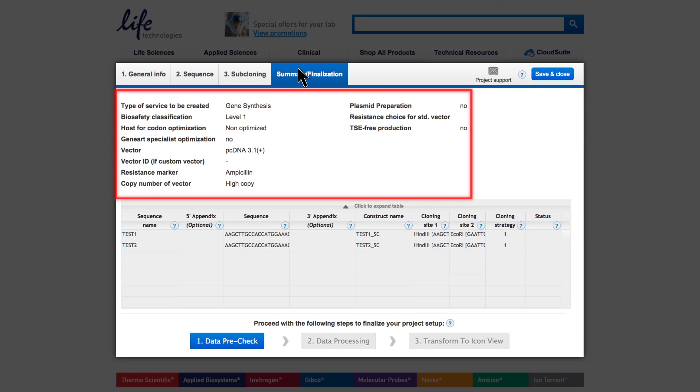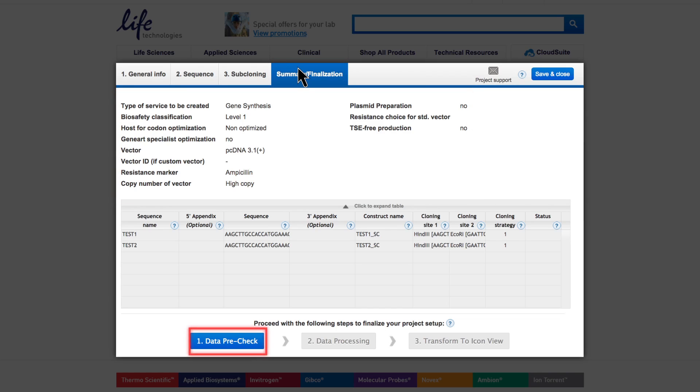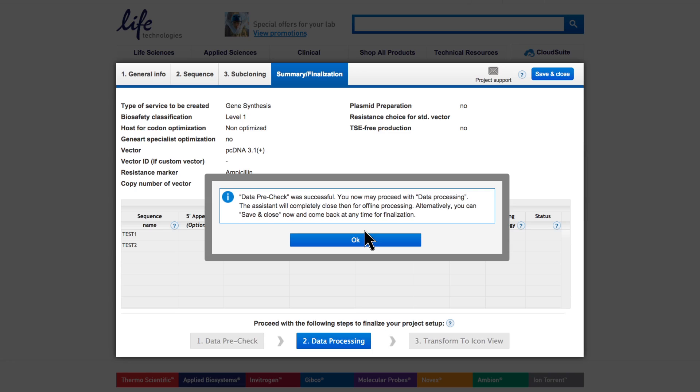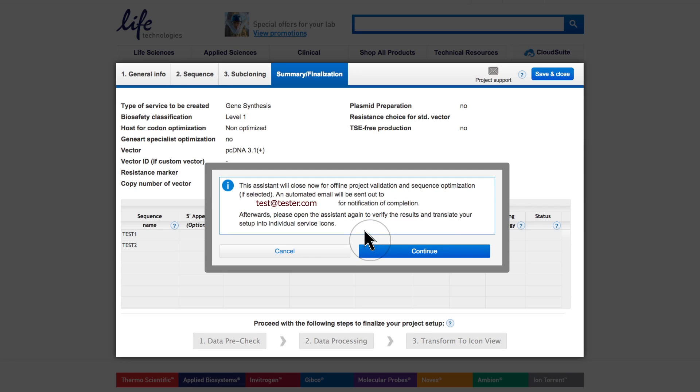Review your project summary. Then push the Data Pre-Check button to start your check out of the Large Order Assistant. If all data input was verified to be valid, confirm that you want to proceed. Then push the Data Processing button. After a final confirmation, the Assistant will go offline for processing, allowing you to do other jobs in the meantime.